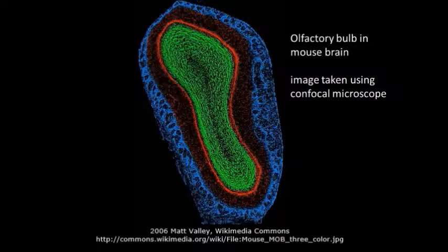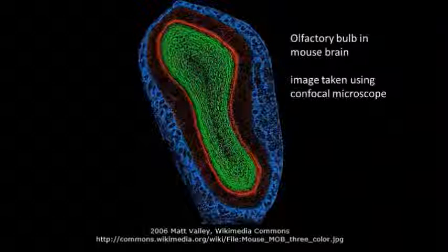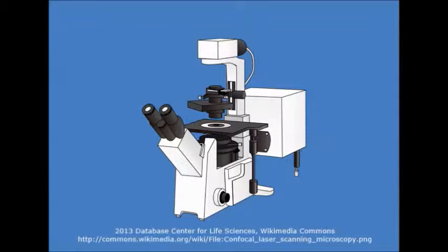Confocal microscopy is most frequently used to image biological samples, but is not limited to the field of biology as it is used in material science, semiconductor inspection, and life science.